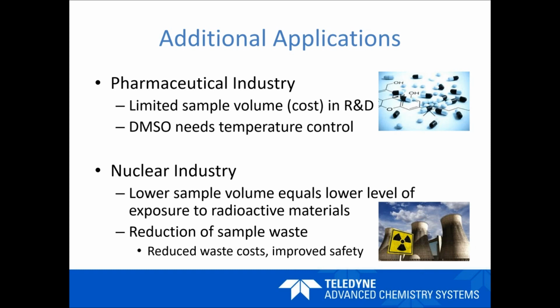And then there's also things like the DMSO solvent, a common solvent in the pharmaceutical industry, which has a solidification point of about 17-18 degrees C, so quite close to room temperature. So if you've got a cool day in your lab, you might end up with a problem with your DMSO matrix. So having the DMSO-based samples analyzed through the MVX system, you'll first of all get a benefit with being able to work with temperature control, but again as well, with it being an organic solvent, low volume, low flow rate, you'll be able to realize some improvements in limits of detection.